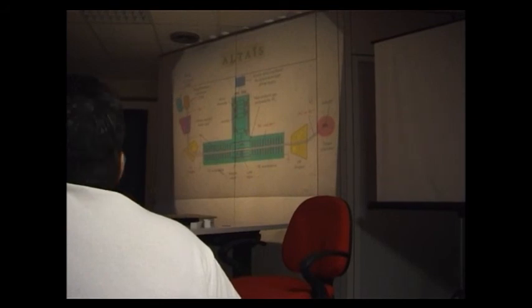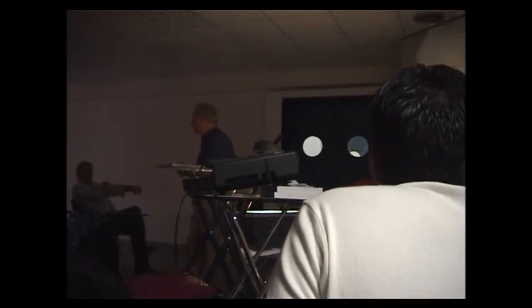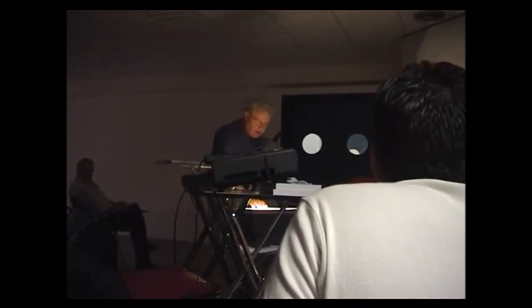For example, to make analysis of materials by sending protons or alpha particles on materials and then detecting characteristic X-rays, or to implant material in order to modify the surface of those materials and to produce new ones.